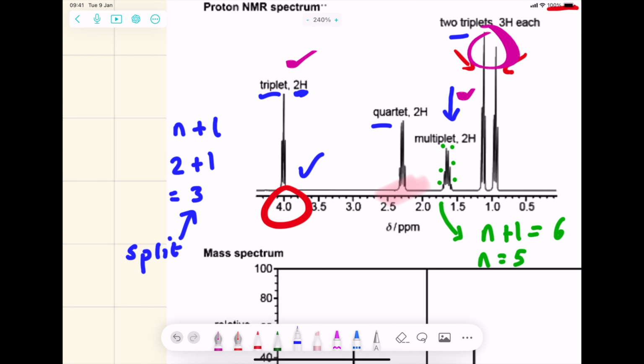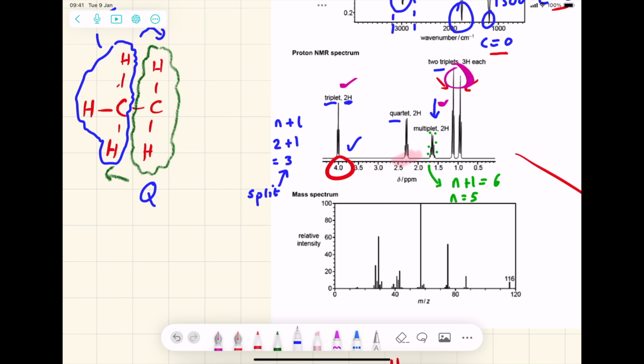And if I go to my datasheet, the options between a chemical shift of 2 to 3 are a benzene ring with a CH group on, so it's definitely not going to be that. A carbon with a hydrogen attached, which is bonded to a nitrogen. Well, there's no mention of nitrogen in the starting paragraph. It's just a hydrocarbon with some oxygen, so it's definitely not that.